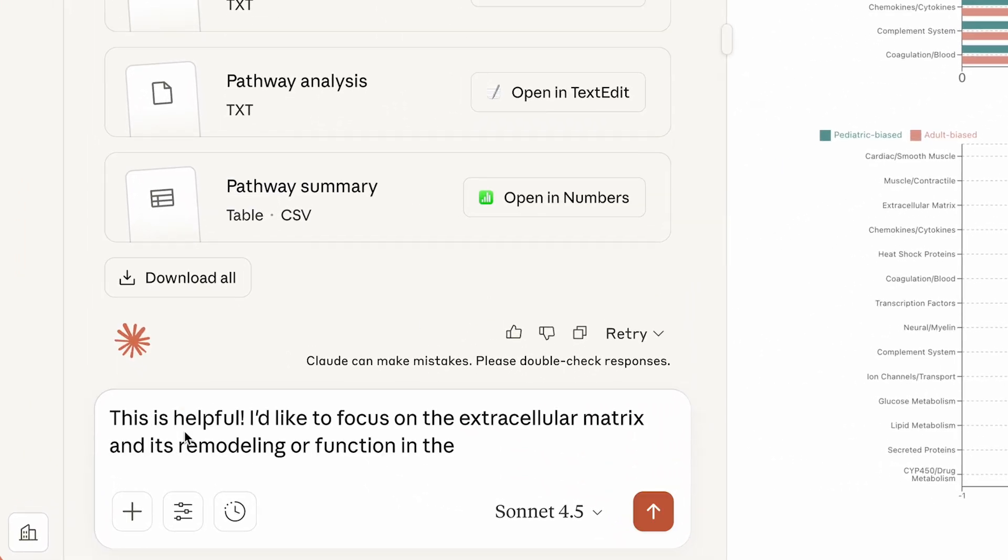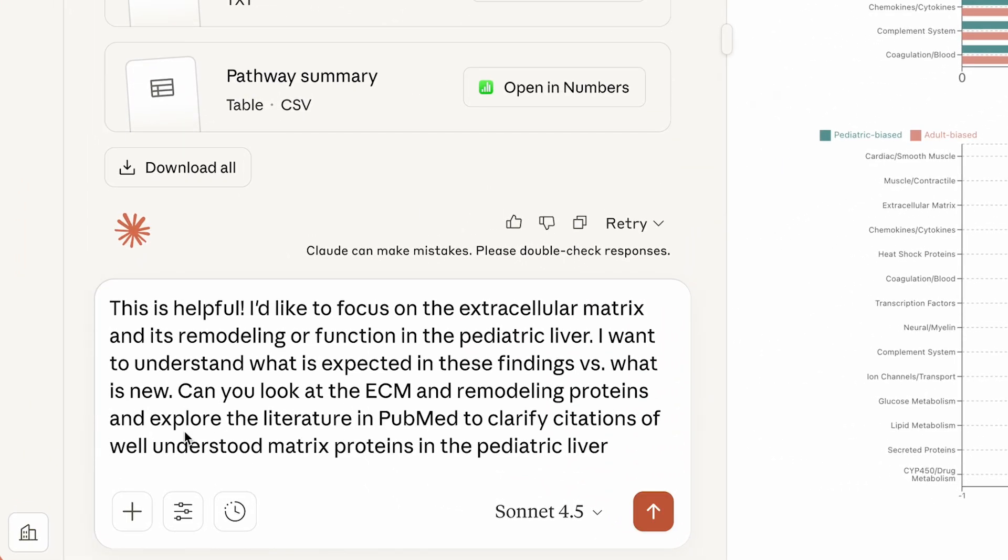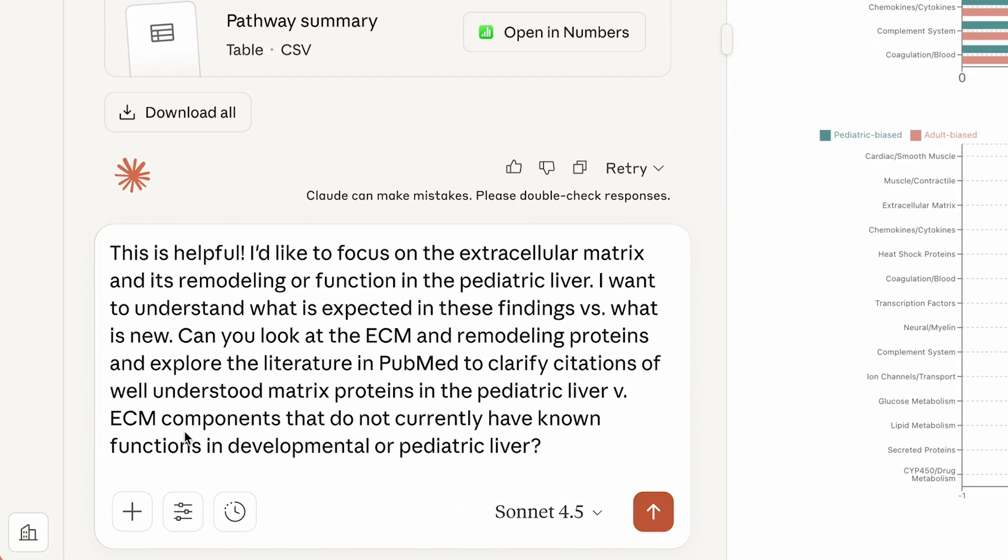Claude helps Anne by identifying cellular processes and structures that might be of interest. Anne picks one that piques her curiosity.